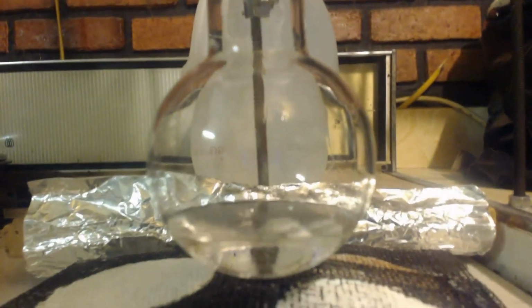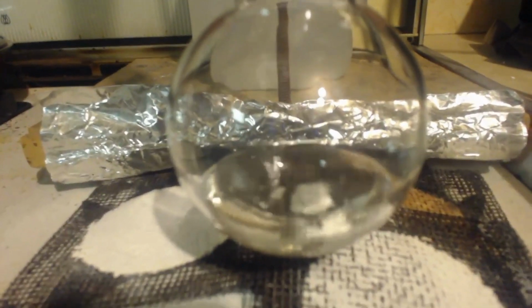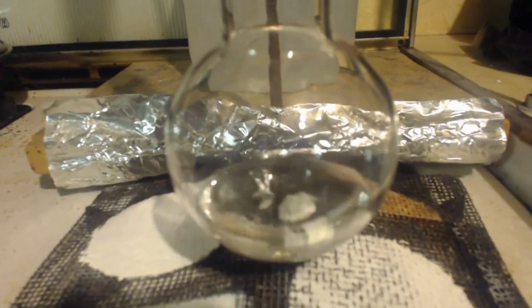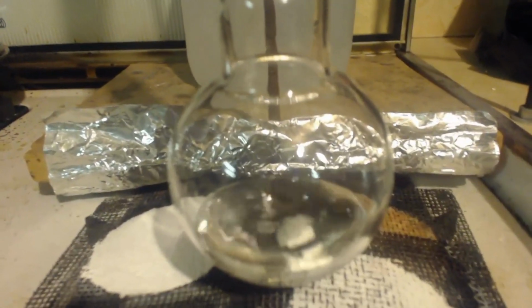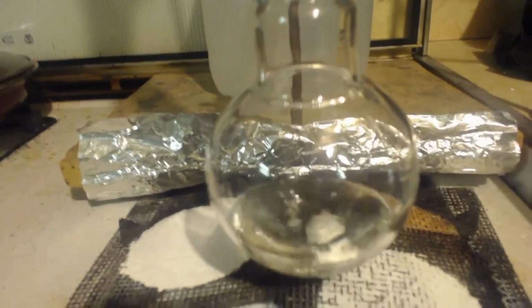Reason why, first of all, I've got to do this again. I have to do it in a smaller apparatus, do a smaller experiment. I made 34 liters of chlorine, and I bubbled it through in less than 20 minutes. Must have been 15 minutes because I had a leak, and the fume hood I was using, I still haven't fixed. Although I finally did after 3 years. I ripped the fans out, and I'm going to put them in again the right way, inside the fume hood. And I'll definitely do it smaller.